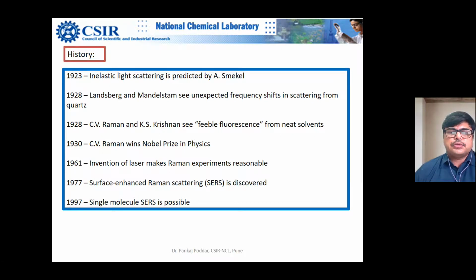So, yes, physicists were looking at different systems, and the real excitement came when lasers came to the market. A laser is a very strong, monochromatic source, and you can also have linearly polarized light, and then you can get S or plane polarized light. So that made a lot of difference in the popularization of this technique. People say that it was like chemists adopting the child of physicists.